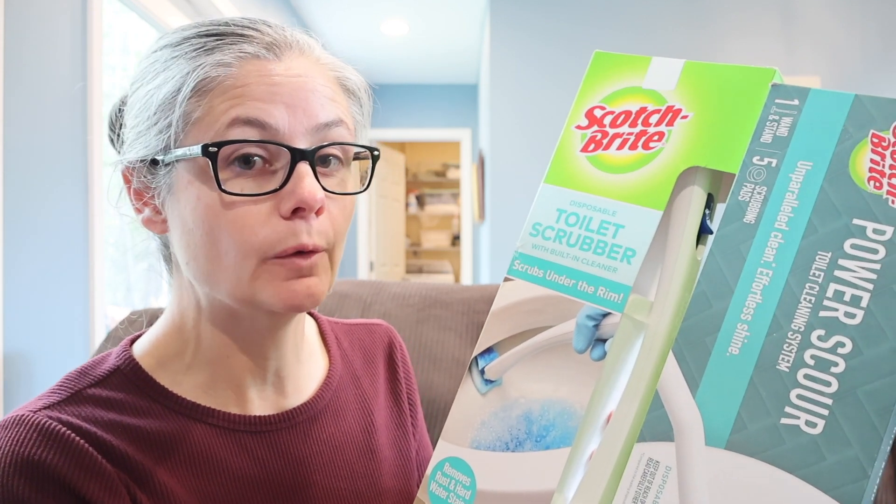It's interesting — on the Power Scour, it says to start in the water and work your way up. But on the toilet scrubber, it says to dip it in the water, start on the top, and work your way down. Very interesting. I'll do exactly what each product says. Let's see how well the Power Scour and the toilet scrubber remove bacteria from my toilet bowl.